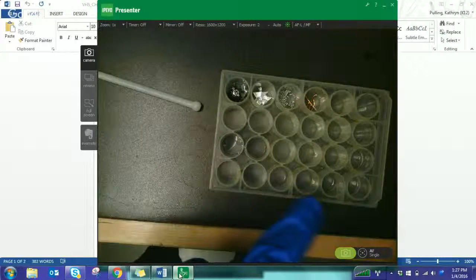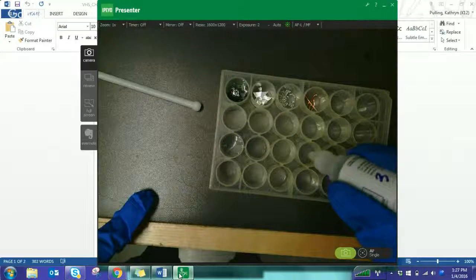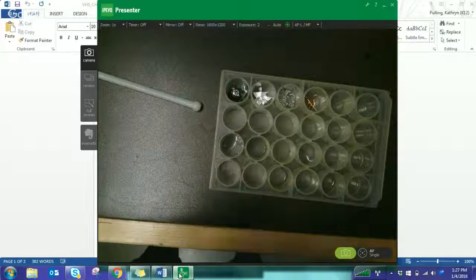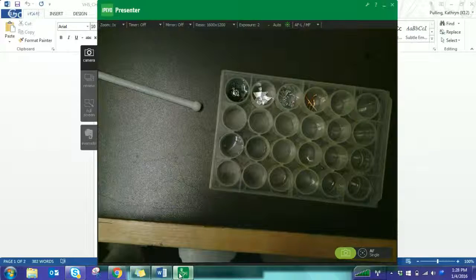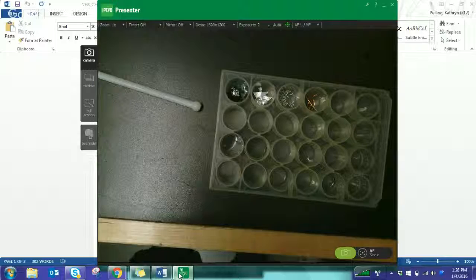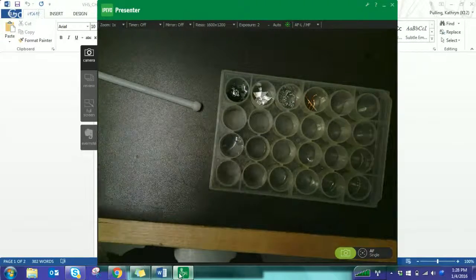I'm also going to put sodium chloride in 4A. 10 drops. All right, and it even suggests doing this. Then the sodium hydroxide in 2A and 5A, or in my case, 2C and 5C.